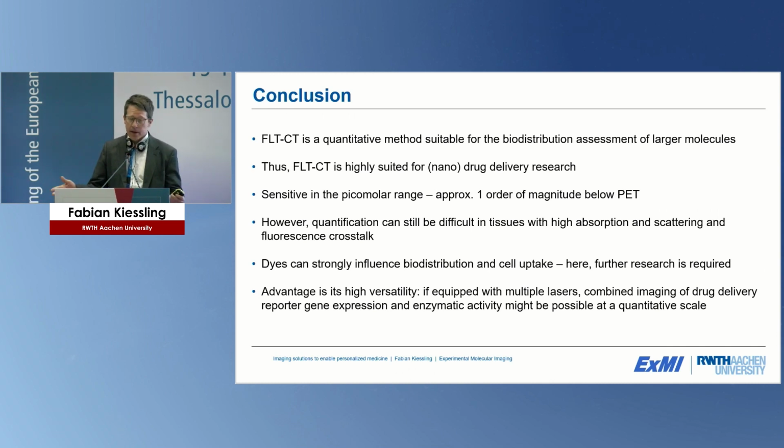But most importantly, I think, if you do optical imaging, also look at the dyes that you use. Consider that the dyes will change the pharmacokinetics, even for such large molecules like whole IgG. There is an impact, and you need to know it in the interpretation of your results. And if I would be allowed to have a wish on the system, which I think is really a great system, I think optical imaging is really a very potent tool.